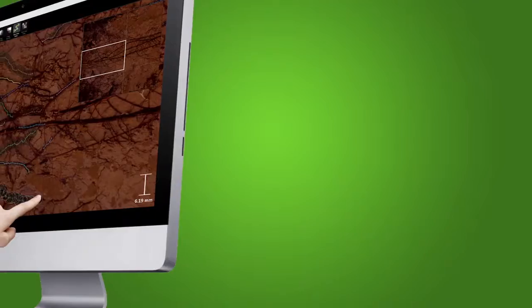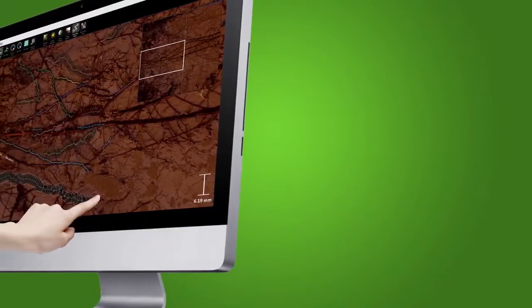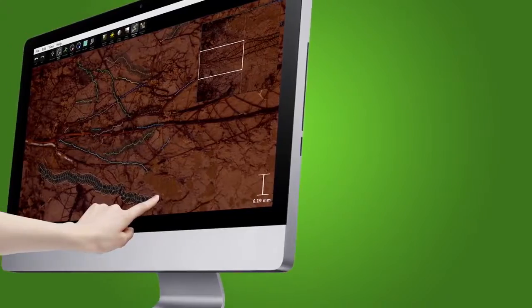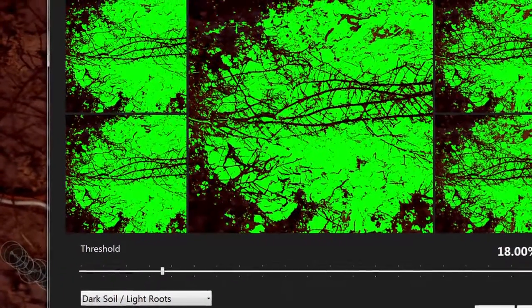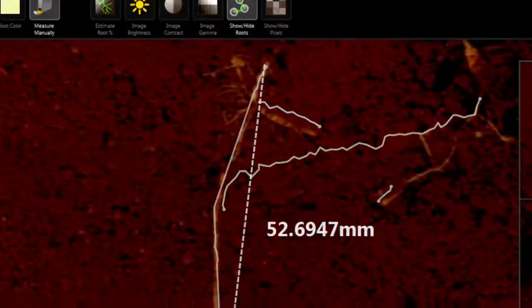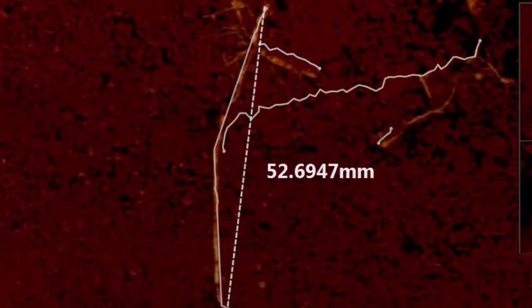Later, these images are downloaded to a computer where they can be analyzed using the included RootSnap image analysis software. Using RootSnap, growers can easily map roots and measure aspects such as root length, area, volume, and diameter.